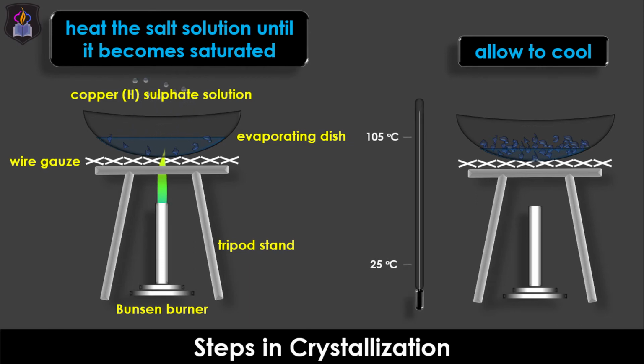However, if you are not patient enough to wait for the complete formation of the crystals from the solution, you can add pure crystals of the salt to the saturated mixture, and this will induce the rapid formation of the crystals. Alternatively, you can scratch the internal surface of the dish with a glass rod to also induce the rapid formation of crystals. This is known as seeding.